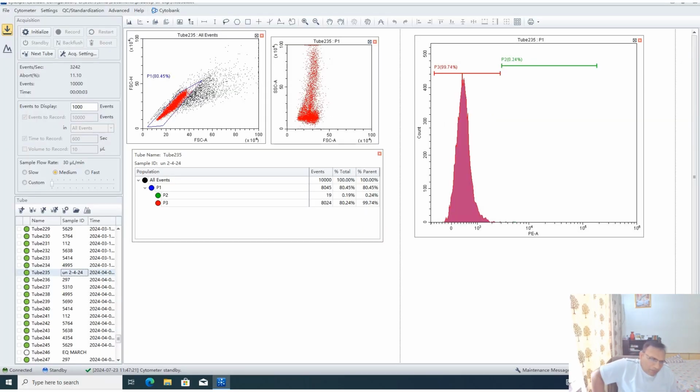For any flow cytometric analysis, first we run the sample without fluorescence to detect the autofluorescence of the cells. For example, we run the sample without MitoSOX. Our cell population comes here, with forward scatter and side scatter measuring the size and granularity of the cells. On the basis of this, we selected this population. This may be doublets or other cells.